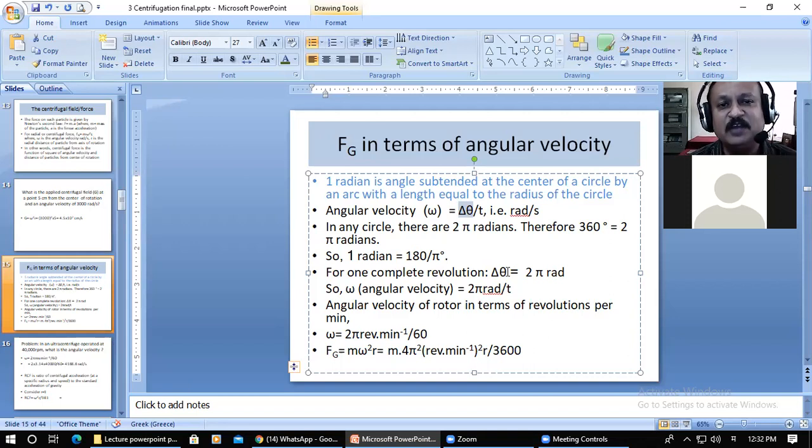If a bacterial culture is kept in a centrifuge machine, and there is a rotor which has a particular radius, and you are trying to centrifuge the particle, the bacteria are all moving in the centrifugal field, and the velocity of these particles will be given by radian per second. That is how many degrees in radian it is traveling per second.